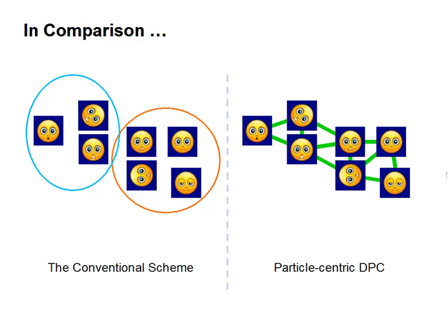And the mutual agreement, for example, between this image and this image is described by a direct linked edge. So with a mutual inclusion relationship, we can build up a very complex graph. And then how to evaluate the quality of each class?